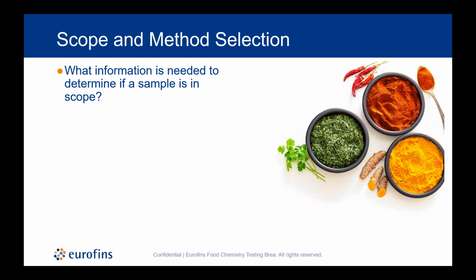So that leads us right into method selection and scope and how to ensure fit for purpose testing. What we need to do that is specific information that will allow us to verify that we select a method that is appropriate based on the type of sample. So the Latin binomial is the genus and species. That's the first piece of information. Along with that, we need the plant part or substance type, if it's not a plant, fungi, algae, that sort of thing.